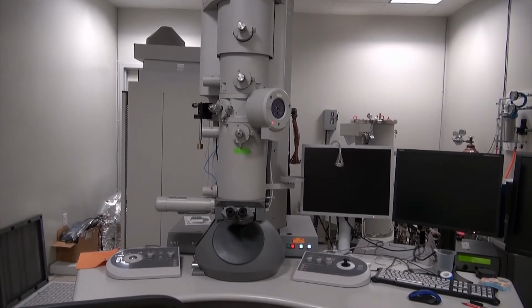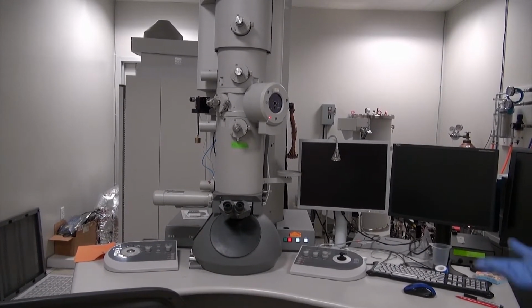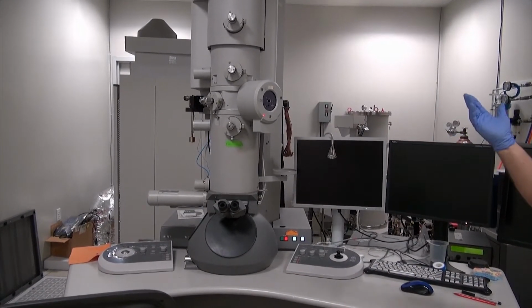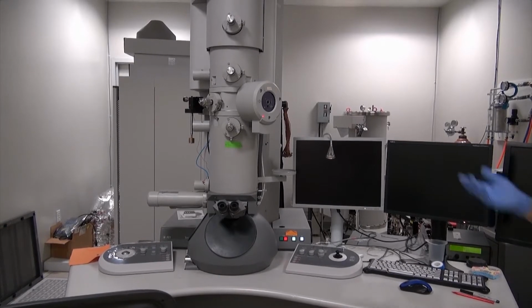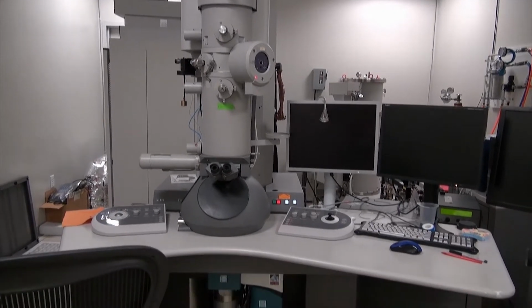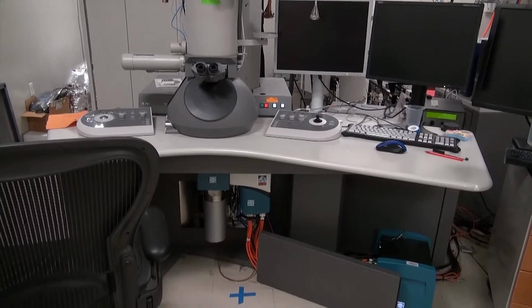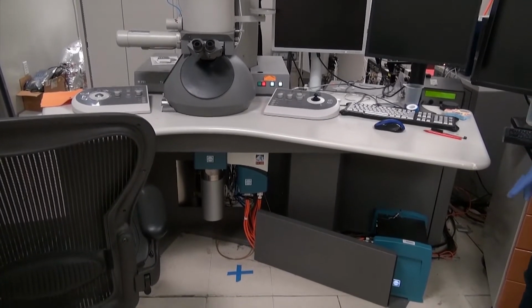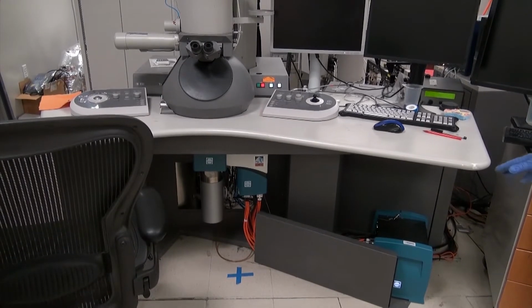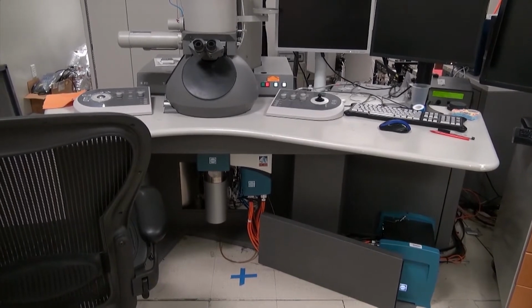It has resolution down to about 0.27 nanometers under ideal conditions, and it has the STEM mode with the dark field detector. We have a Gatan inline filter with a CCD camera, and in addition to that, we have a direct detection Gatan K2 camera, which is used for many of the cryo samples for low dose imaging to minimize beam damage to the sample.